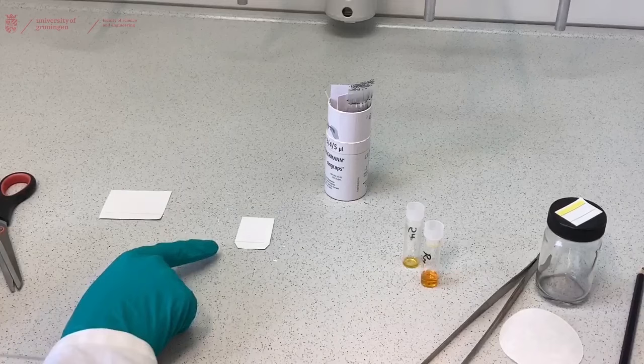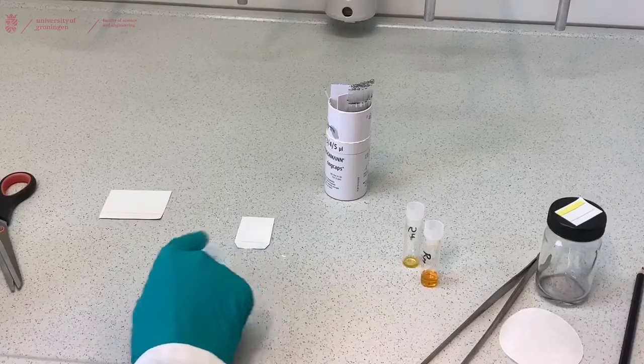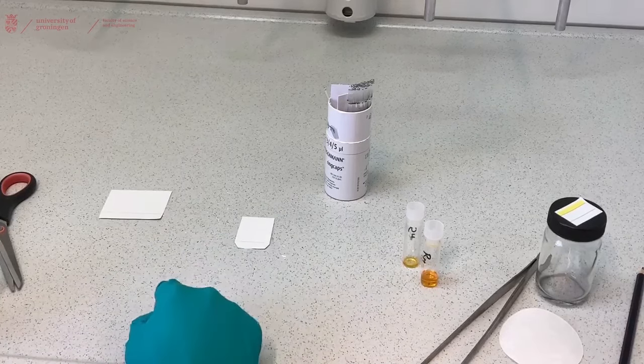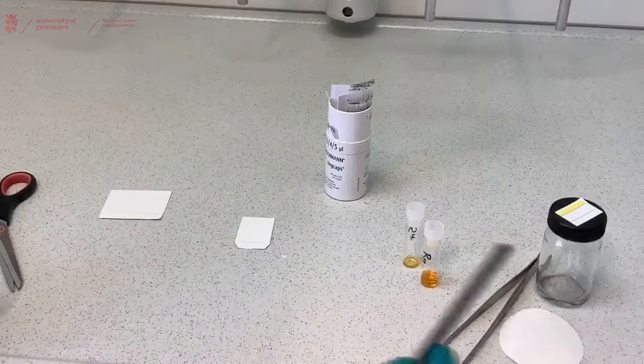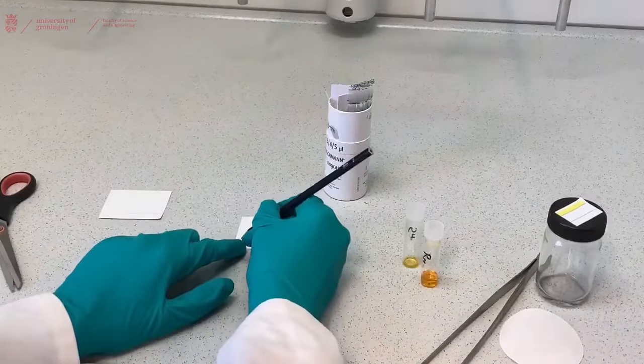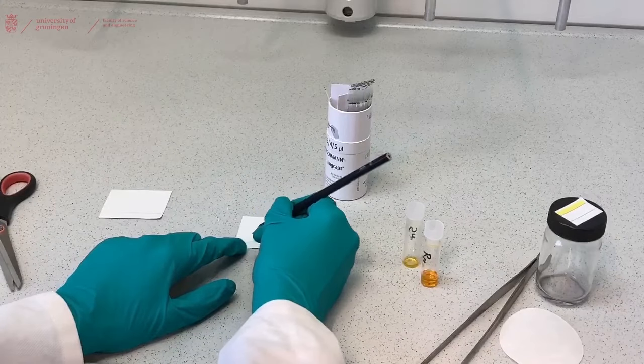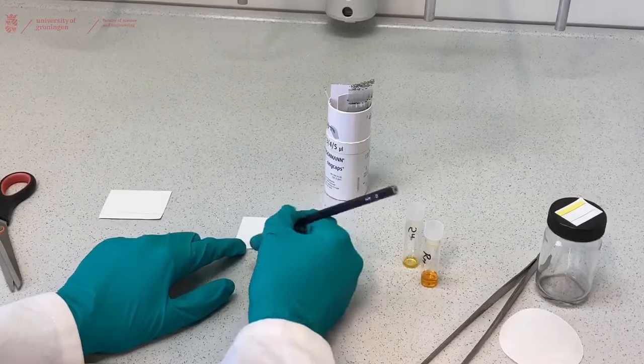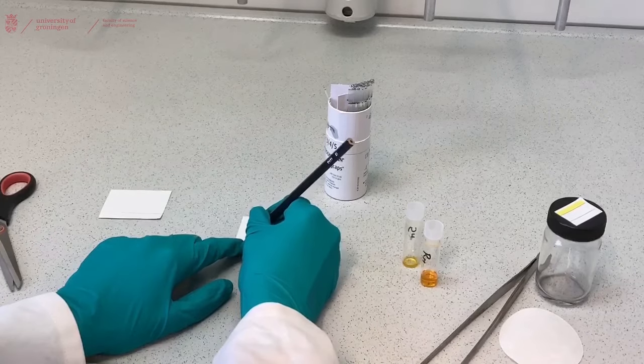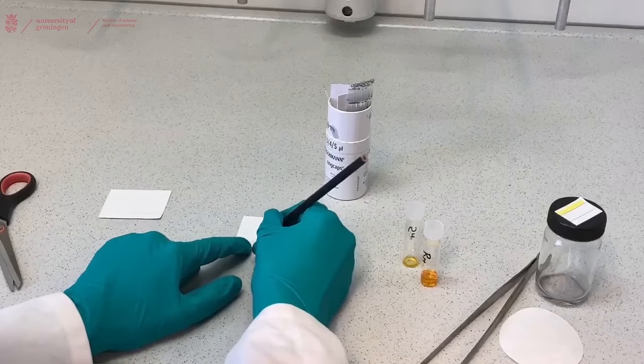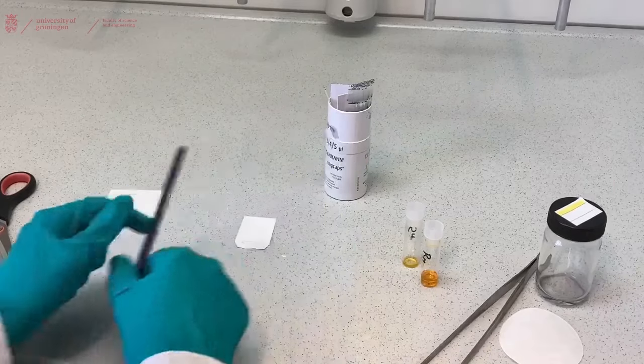We have cut our TLC plate to size, we've cut off the edges and we have a nice straight line. Now we're going to add our starting material and our reaction mixture. Make a small line on the baseline and write down what you're going to place there. So starting material on the left and product or reaction mixture on the right.